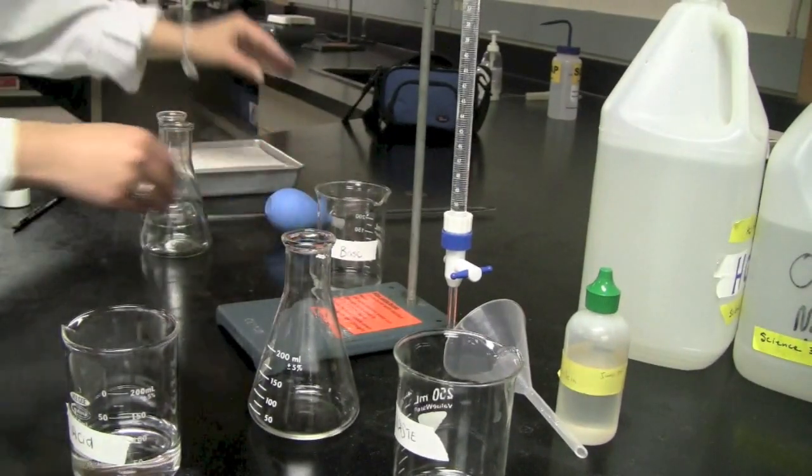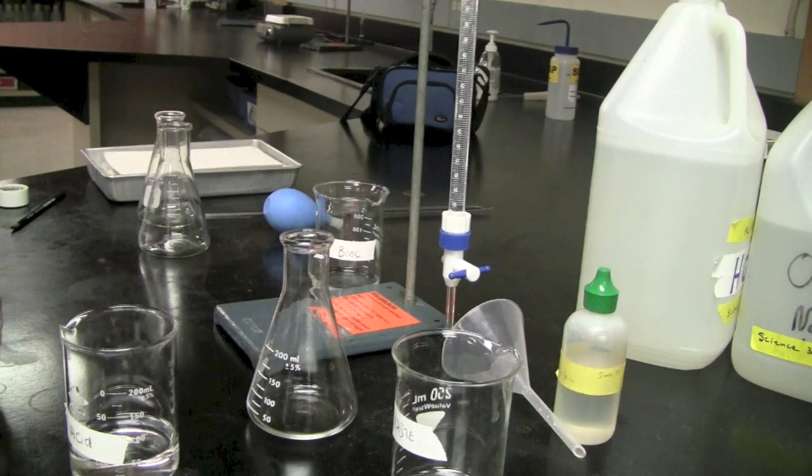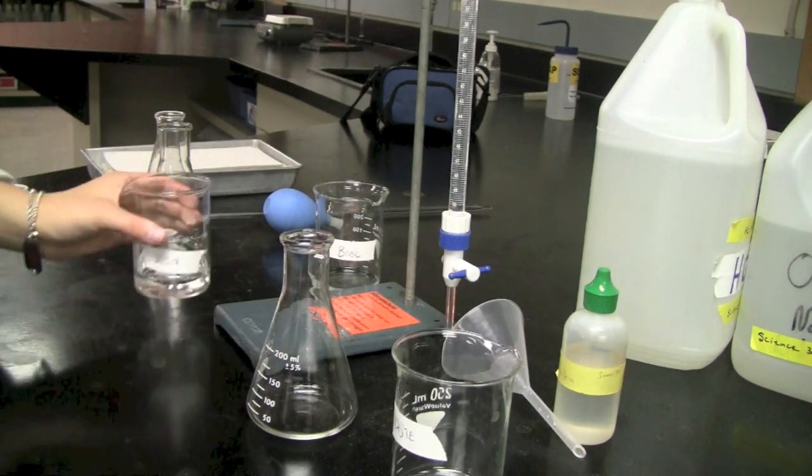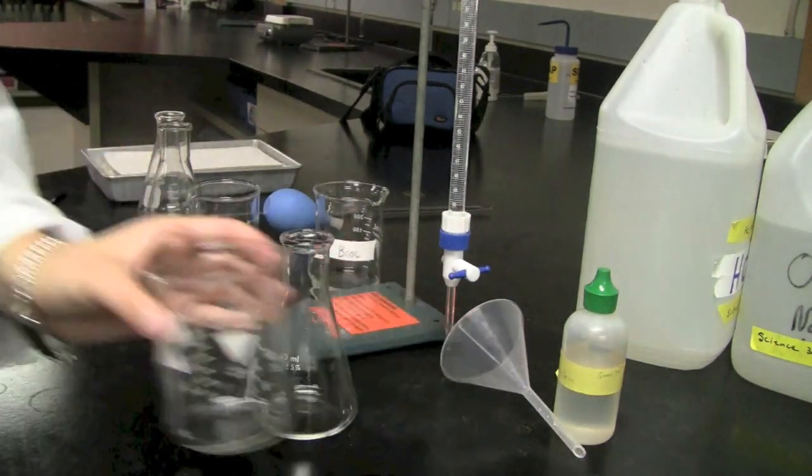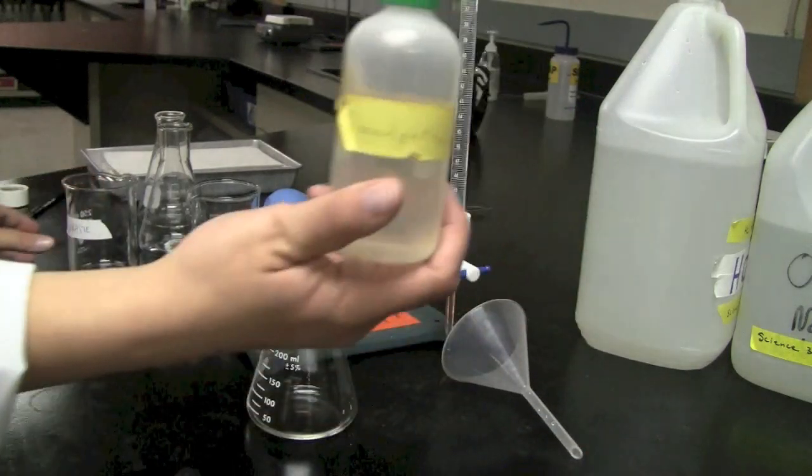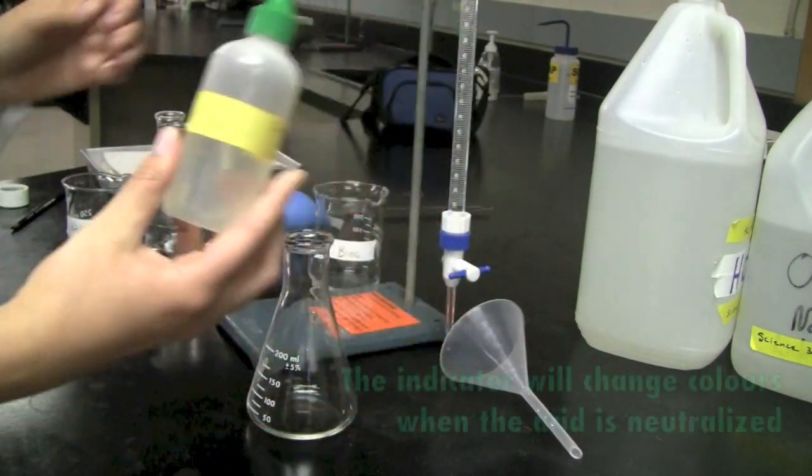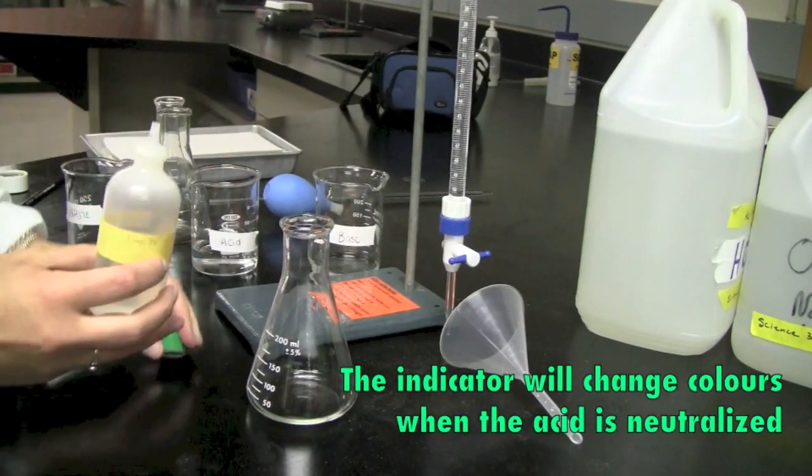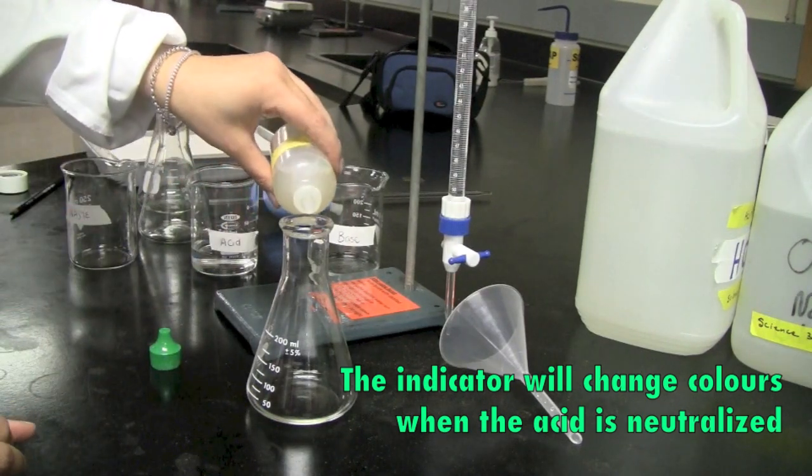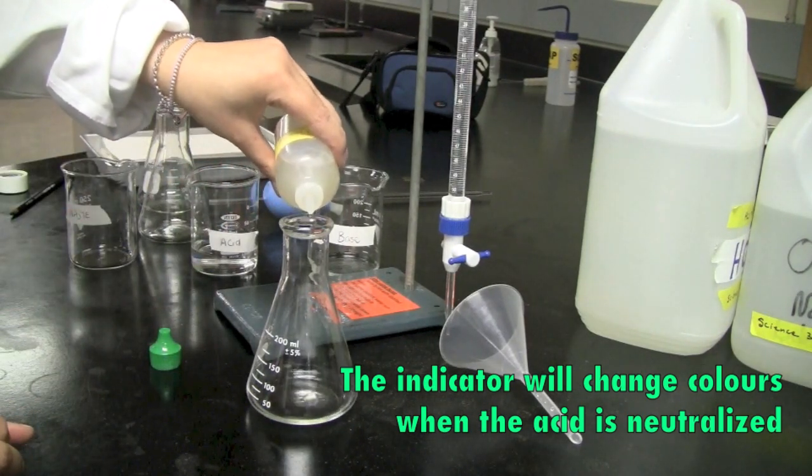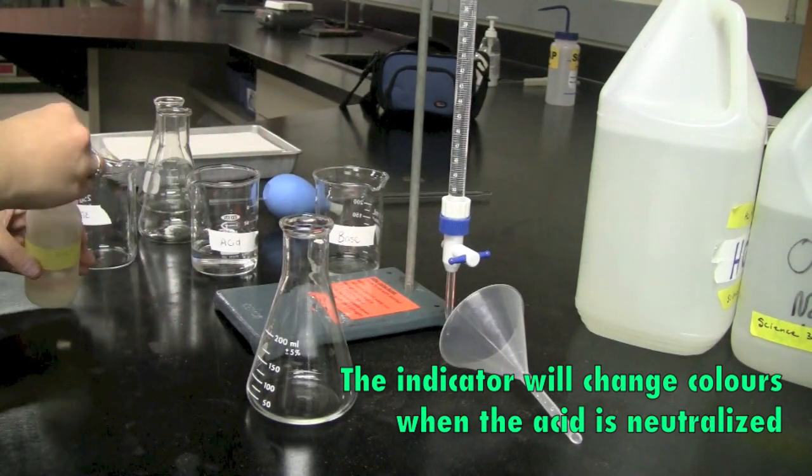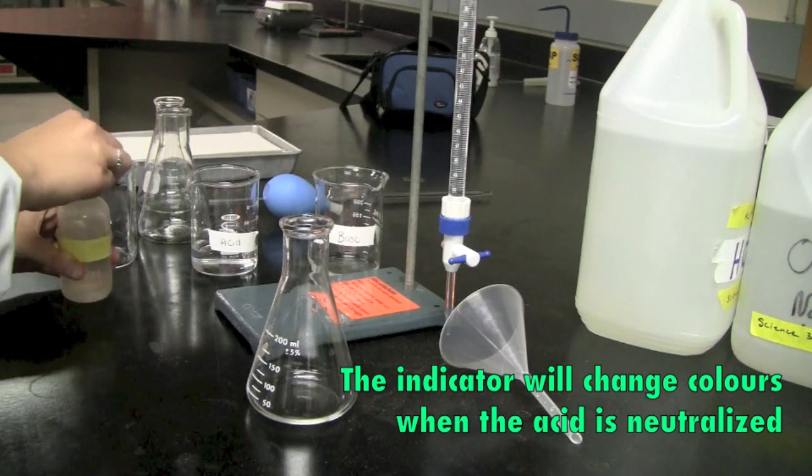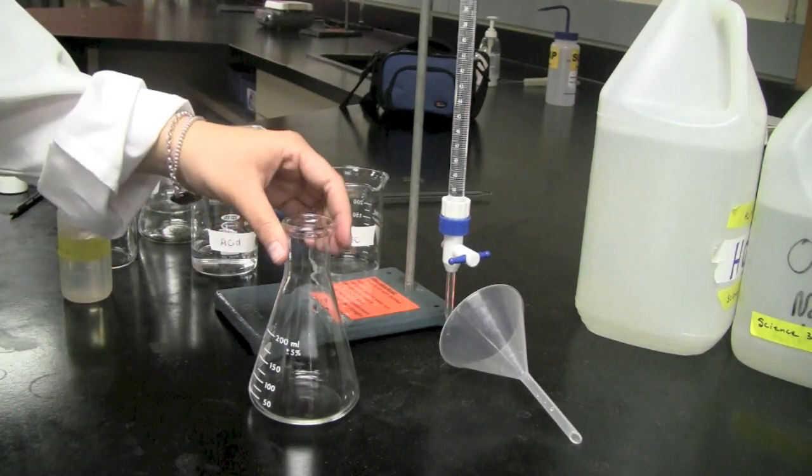So now that we've got the acid prepared, what we're going to do, we're going to take our phenolphthalein and we're going to add two or three drops into the Erlenmeyer flask. We're going to swirl it a little bit just to mix it up so that it's evenly distributed.